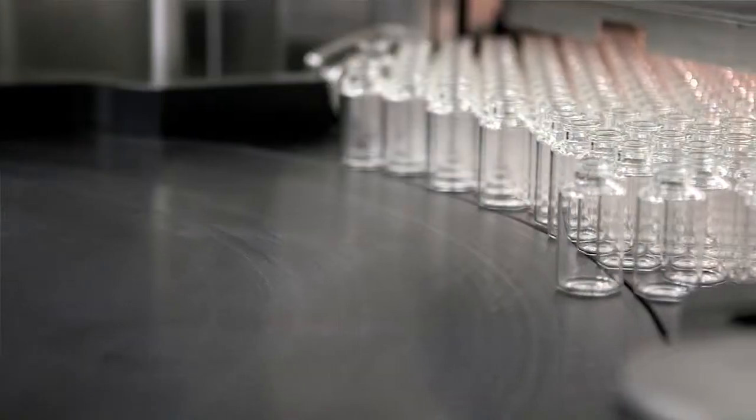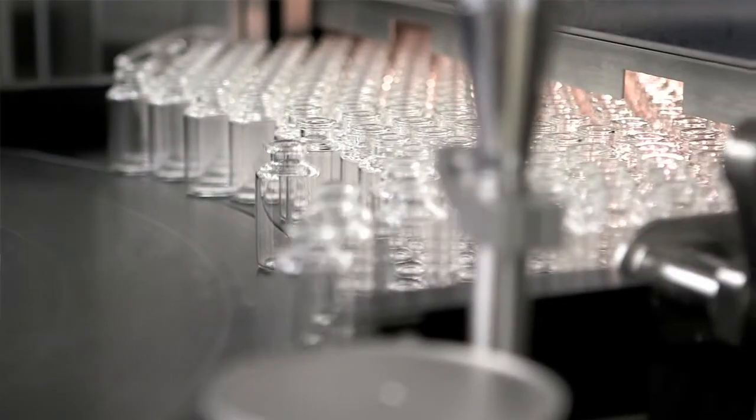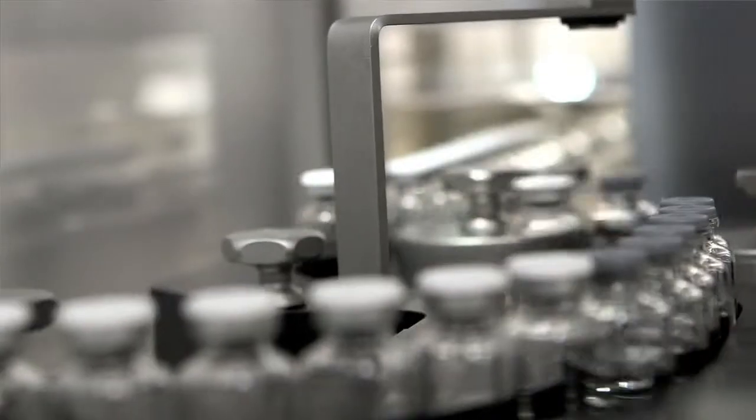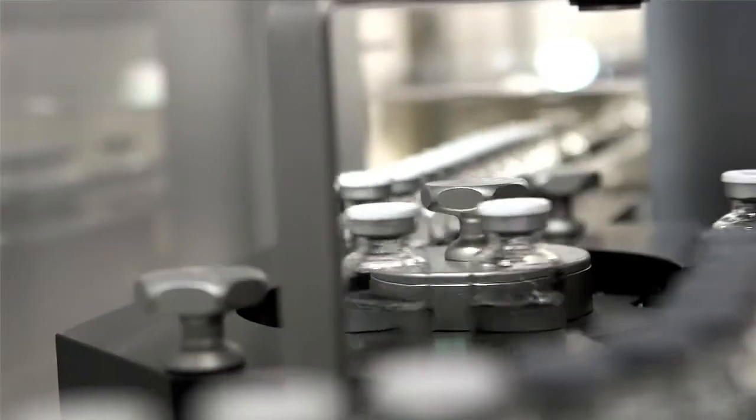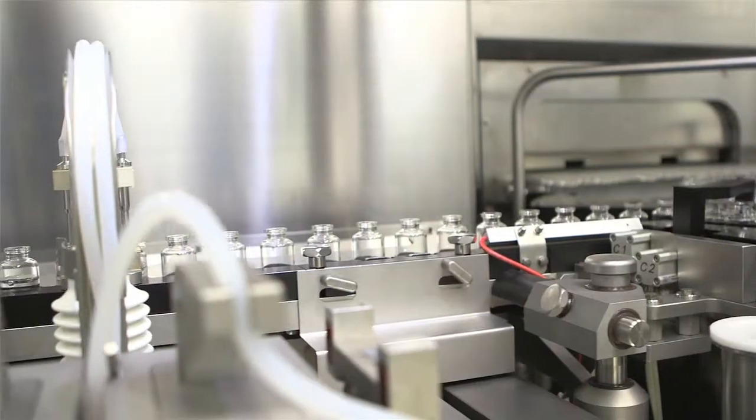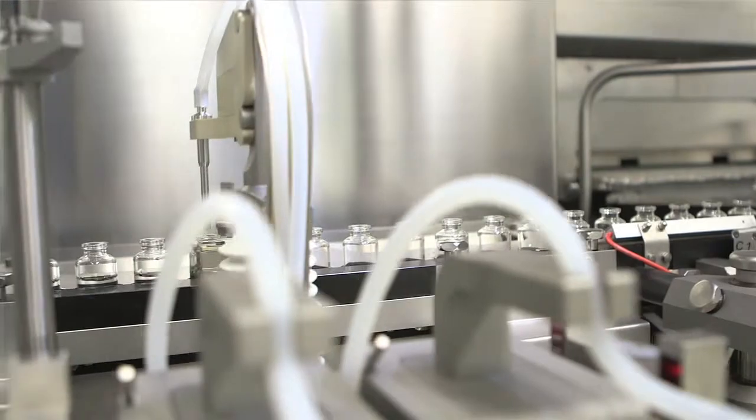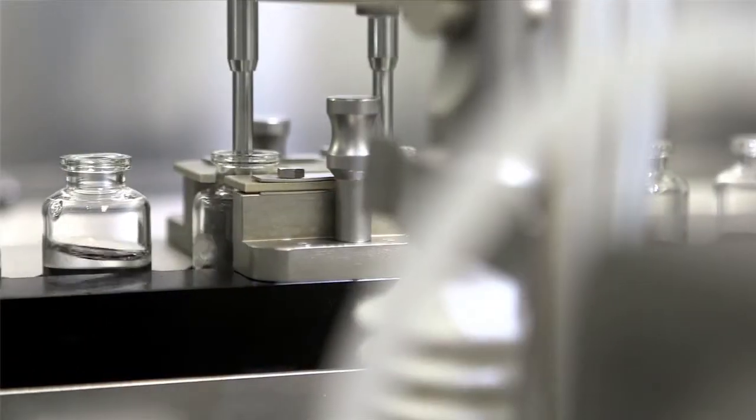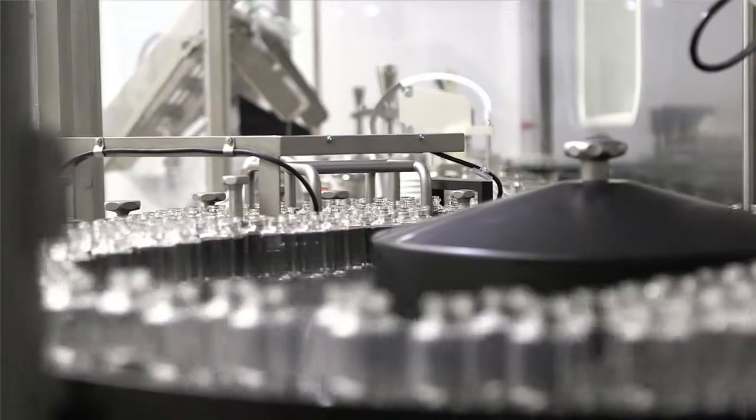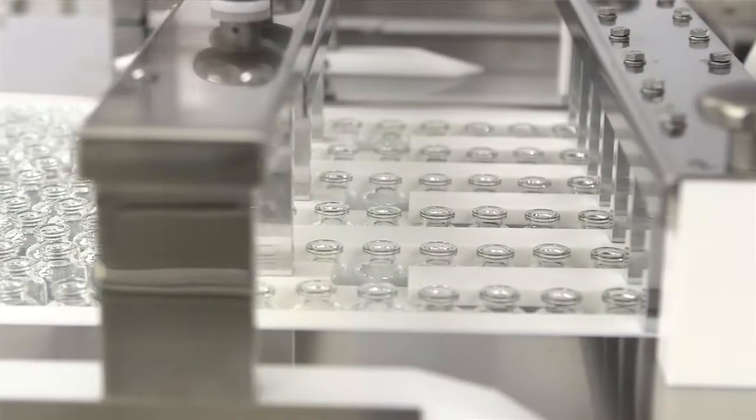DPT Lakewood selected the IMA MAC for a variety of reasons, but most importantly, the fact that we are limiting human interaction with the equipment. The equipment is compartmentalized, so you basically load the vials into the washer, it passes through the depyrogenation tunnel, and the filler itself is enclosed within a system, which is a Grade A filling zone.